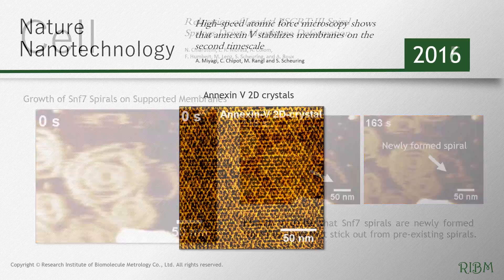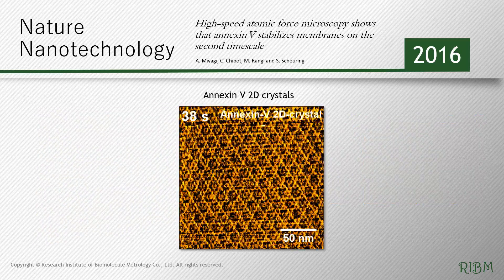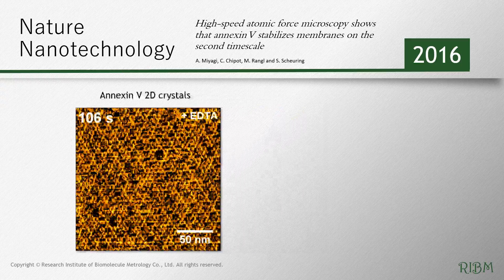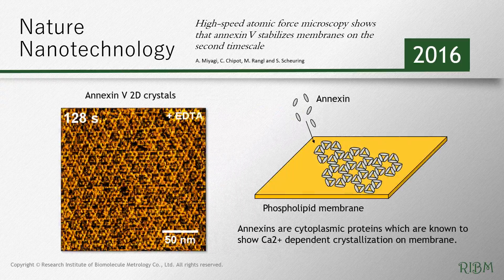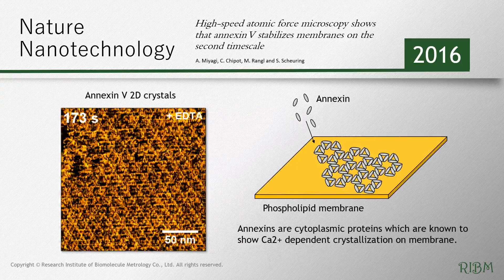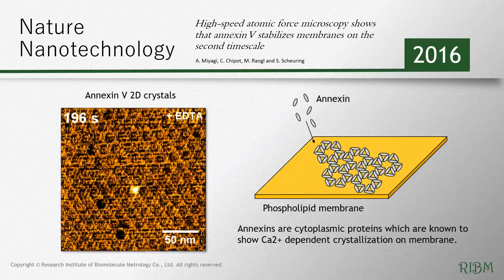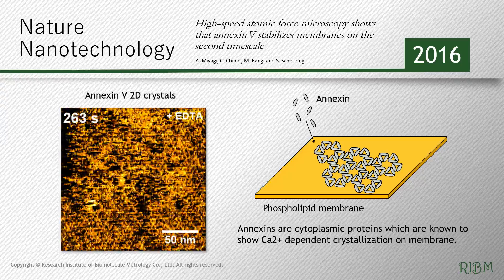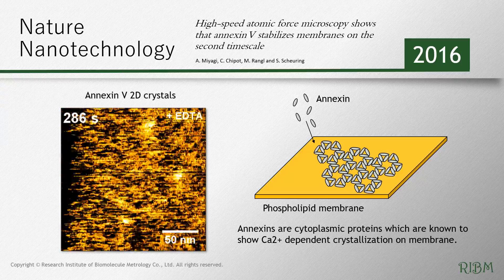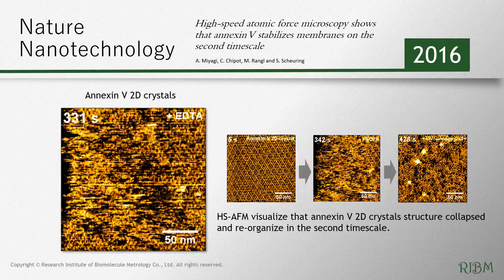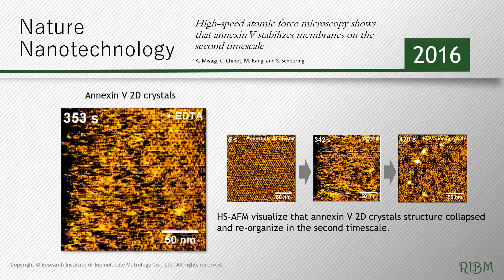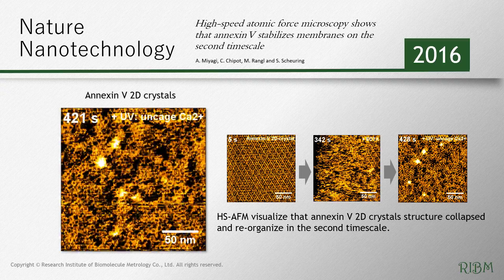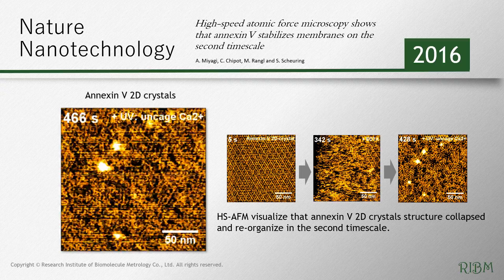The video shows the assembling and disassembling of Annexin-5 2D crystals. Annexins are cytoplasmic proteins which are known to show calcium-dependent crystallization on membrane. High-speed AFM visualizes that the Annexin-5 2D crystal structure collapsed and reorganized on the second time scale.